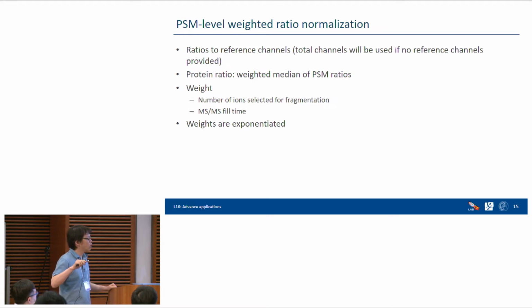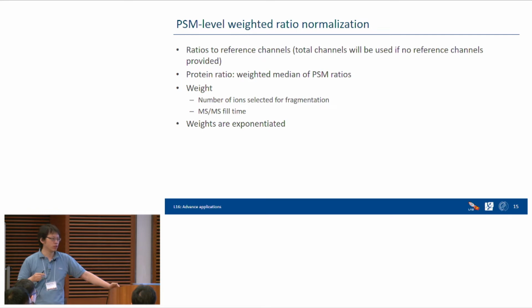But if we go deeper and check the MS2 level, you will see in this green square the signal is very unclear, but in the corresponding one here, we have a clear signal. In TMT labeling, because we have the barcode from the reporters, we can easily find which peptide is from which peptide, and we can increase the identified peptides for quantification.